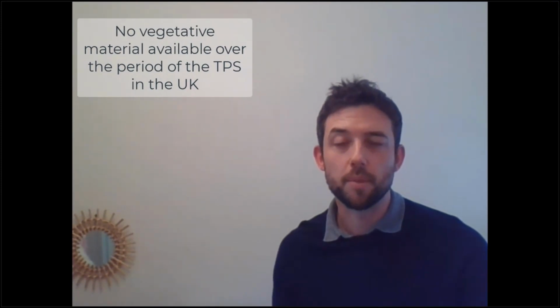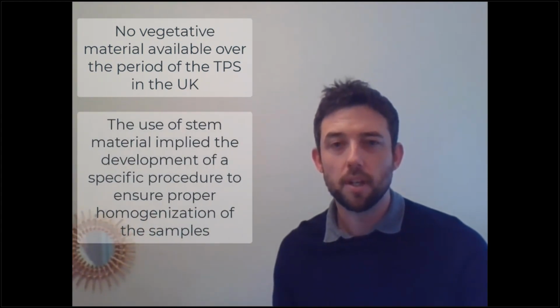Xylophilus ampelinus is a pathogen of vines. In the UK, there was no vegetative material present over the period of the TPS, so we had to use vine stem material. As you can imagine, this is a particularly tough material, so in order to produce a homogeneous sample, we had to try a number of homogenization methods to be able to grind the stem up enough to produce large quantities of lysate.